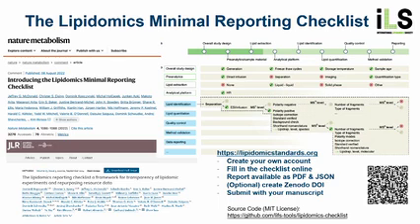A lot of the steps in between are not necessarily tied only to lipidomics, so they might also apply for exposomics, for toxicology, and generally for small molecule mass spectrometry analysis. And the good thing is this reporting checklist has source code that is also openly available under a very liberal license. So people can actually take this, re-implement it, extend it.